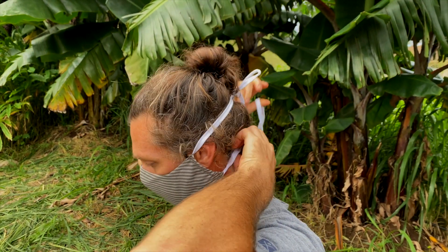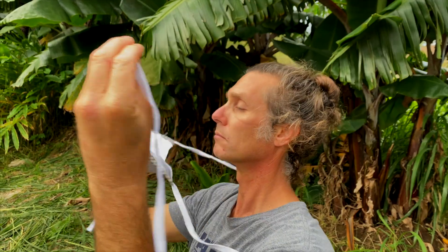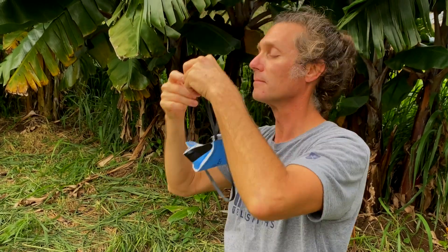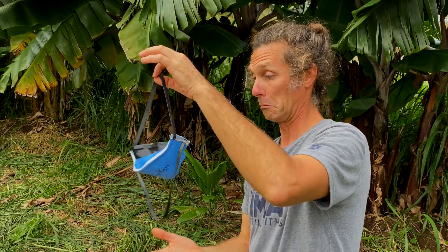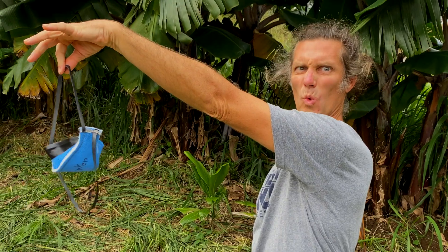Let's start with the ear loop mask: hold both ear loops, then carefully lift the mask away from your face. For the mask with ties, untie the bottom bow first, then untie the top bow and carefully pull the mask away from your face. For the mask with elastic straps, lift the bottom strap over your head first, then lift the top strap over while gently removing the mask from your face. With all these masks, it's crucial you don't touch the front when taking it off.